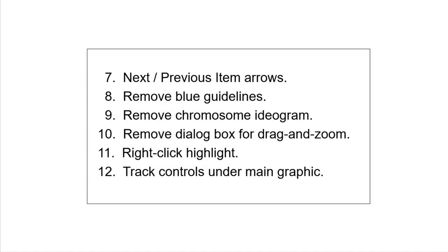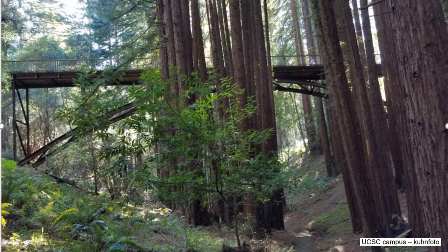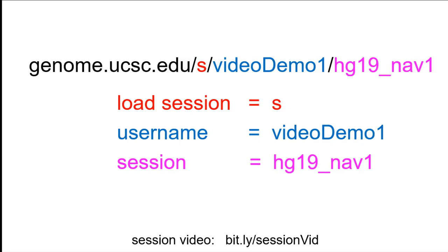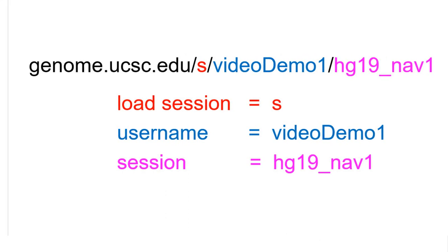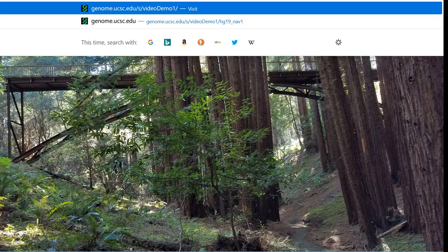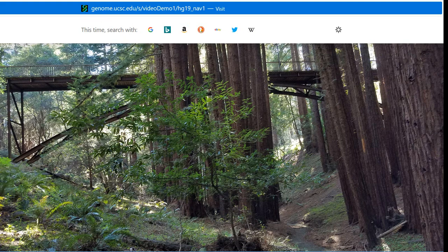At the end of part one, we found ourselves on chromosome 11 with several datasets turned on. To make it easy to find that location again, we have saved the configuration for easy access. The saved sessions feature is the subject of a separate video in the UCSC browser video collection, so it will not be presented here. The session was saved under the username VideoDemo1 and the session name HG19_NAV1. The session can be accessed directly in any browser using the URL genome.ucsc.edu/s/VideoDemo1/HG19_NAV1, which returns us to that same location with all the configuration options intact.